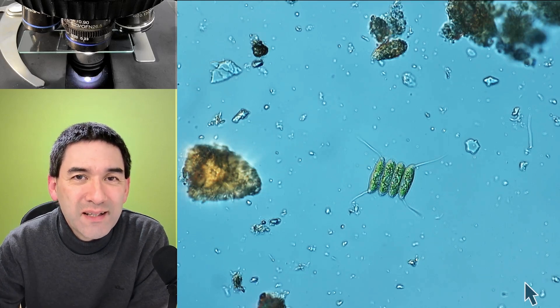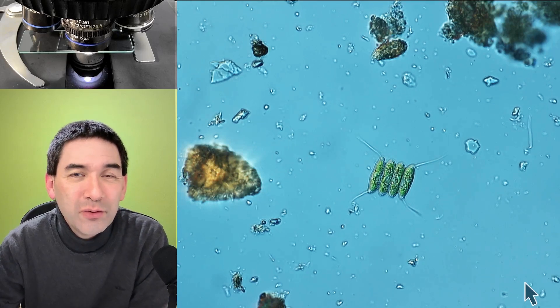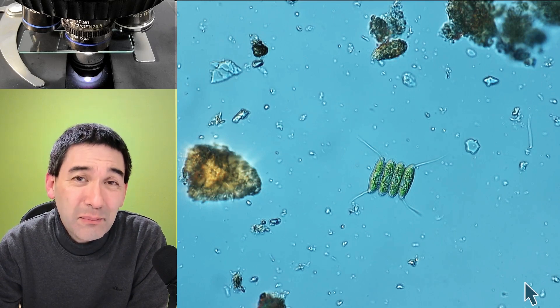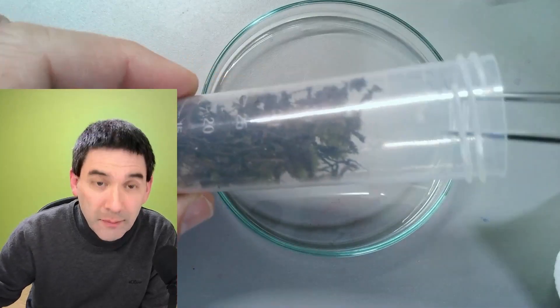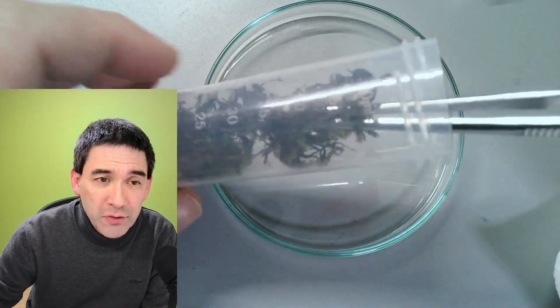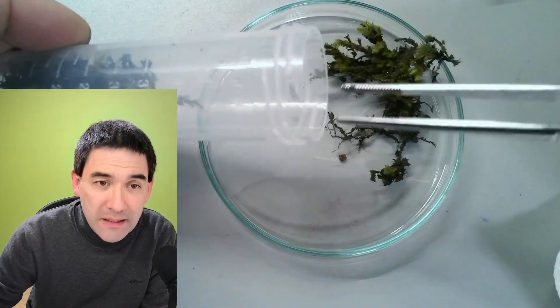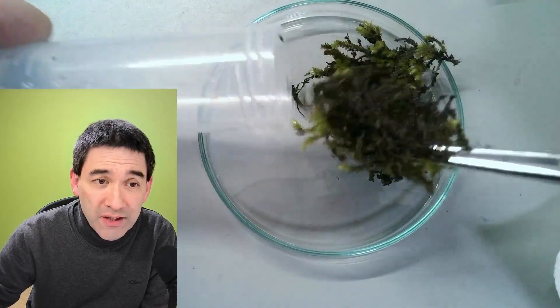So I think what I'm going to do now is I'm going to move on to the next sample and let's put the moss under the microscope. Now in order to put the moss under the microscope I first have to add a little bit of water and keep it moist for a couple of hours because then any microorganisms and hopefully also tardigrades will come back to life.